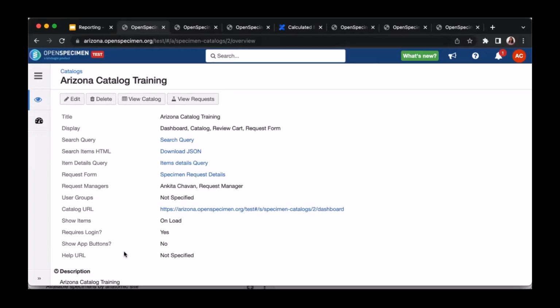Yeah. But in that case, do you want them to see what is available, or not even that? You just want them to fill up a form and send it? We want them to see what's available. They just may not be comfortable building a query. It might help them figure out what they want if they can see it, though. Yeah. So that is possible.